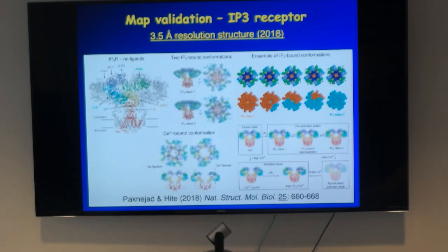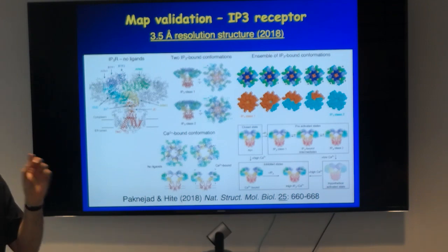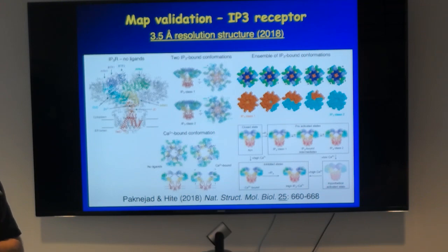So actually, when you cross-link a few parts of the protein. What Brian Chait has done at Rockefeller with Mike Rout on the nuclear pore complex, they actually found that you only have to do a few cross-links to stabilize the entire nuclear pore complex.